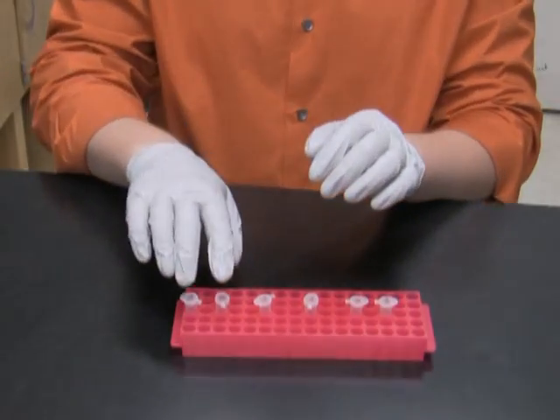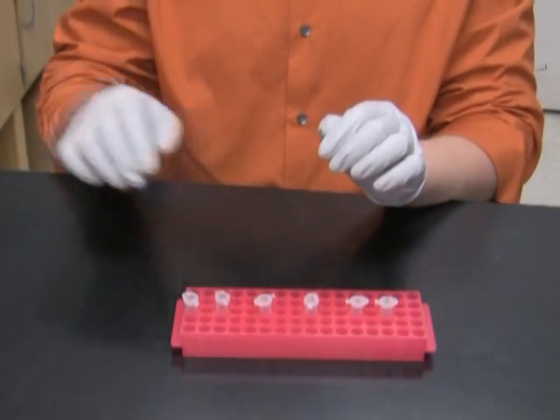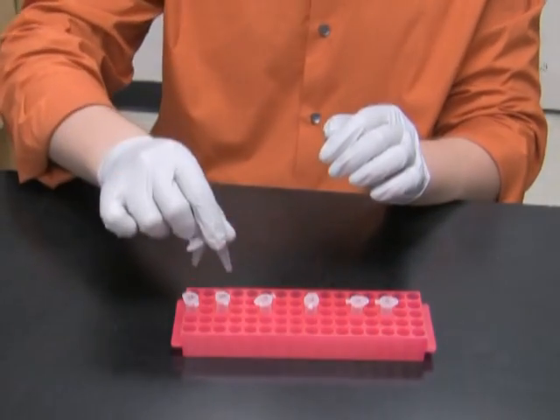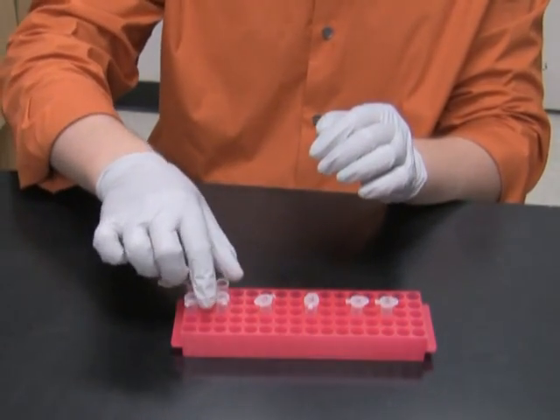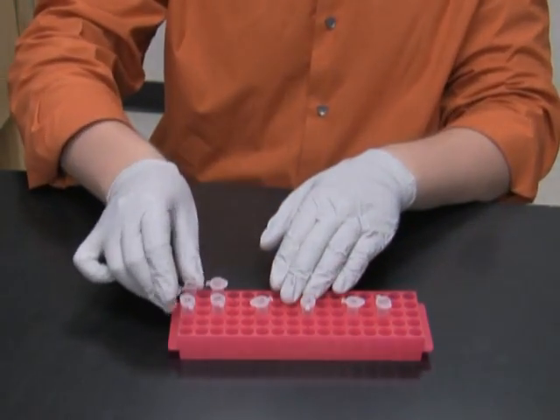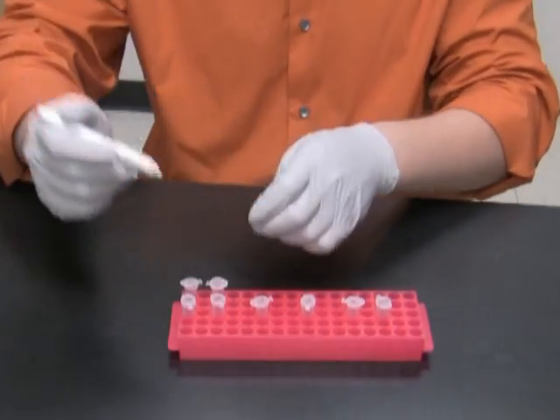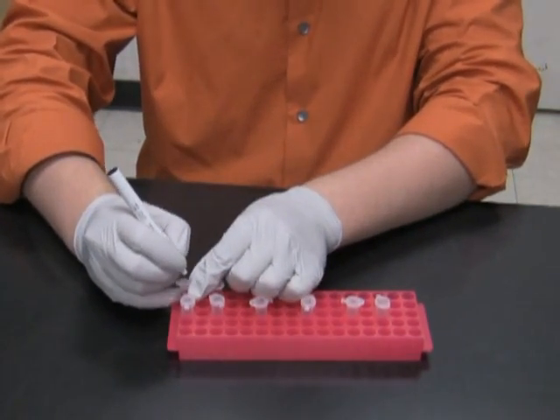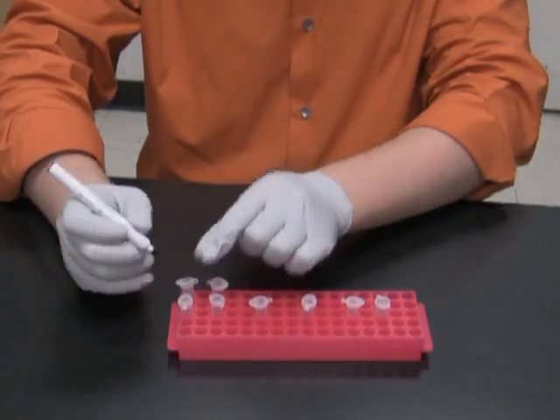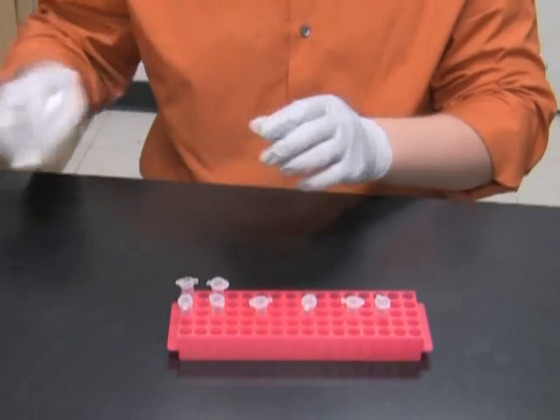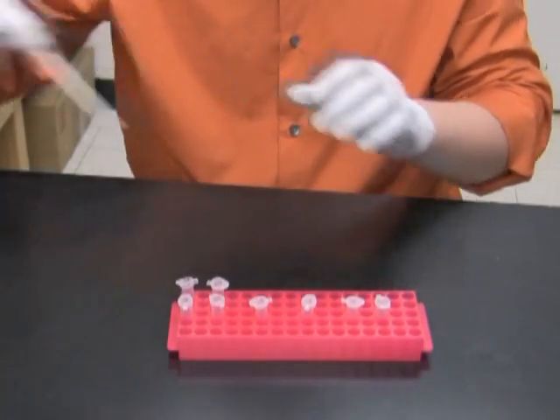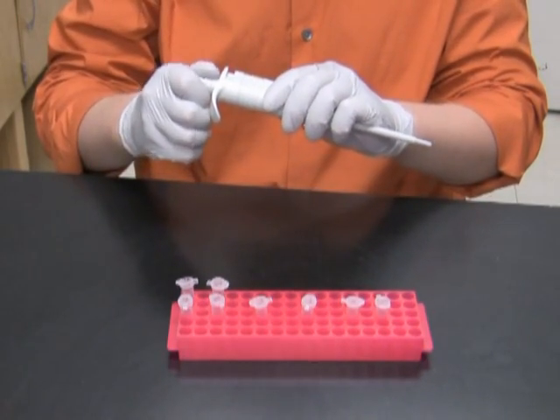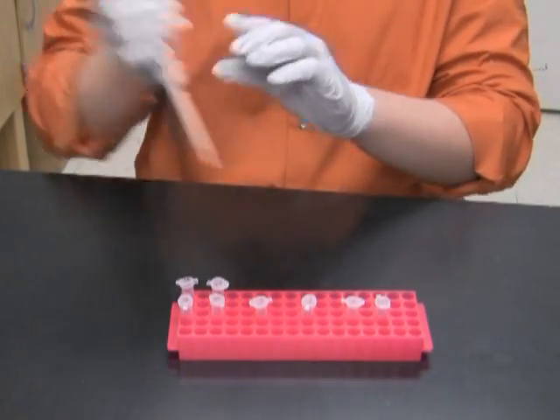Now I'm going to split the contents of the ligation tubes into two aliquots. Here I have two new tubes. One of them I will label as vector plus insert, another one as vector control, and I will transfer 10 microliters from each of the ligation tubes into its replica.